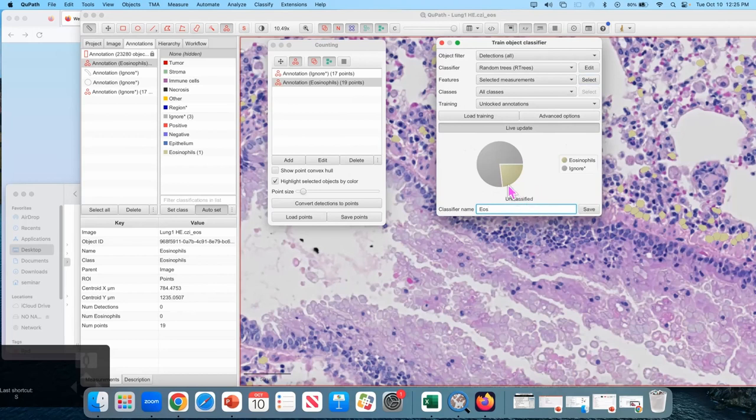The process of crafting those machine classifiers is quite elaborate, and there's no prescription, do this and this is going to work. It's done by practice, and you've got to try stuff until it works. And for certain kinds of images, you might need certain things and it's going to be completely irrelevant for others. Okay.